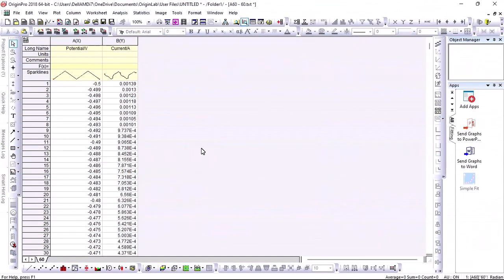Hello everyone. So in this video we will discuss how to separate each cycle from the observed cyclic voltammetric data.